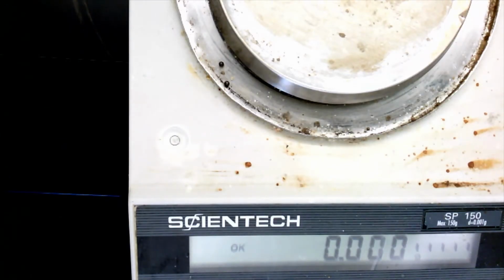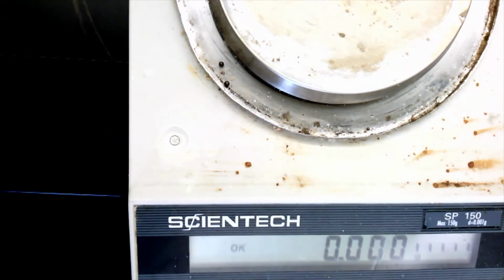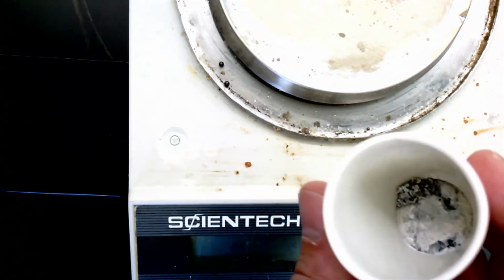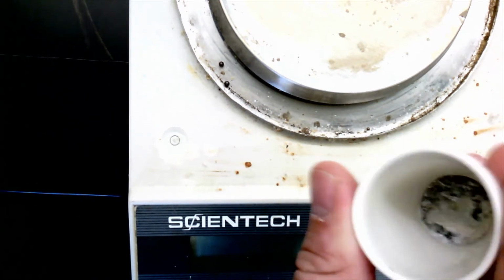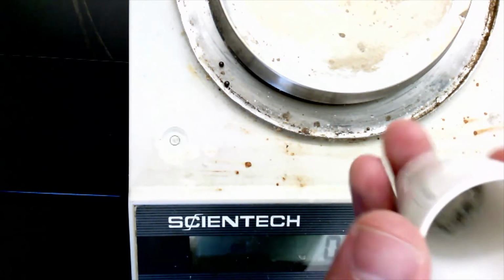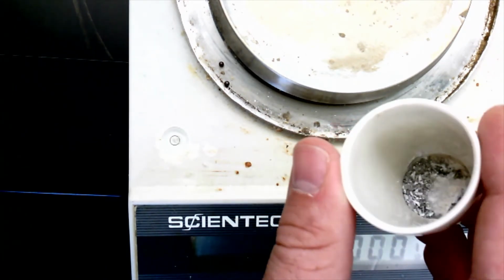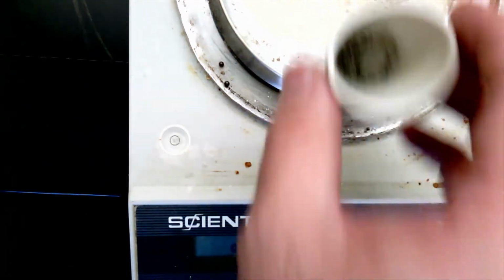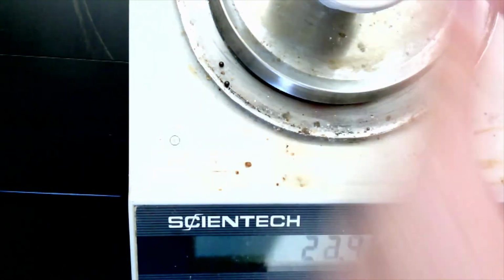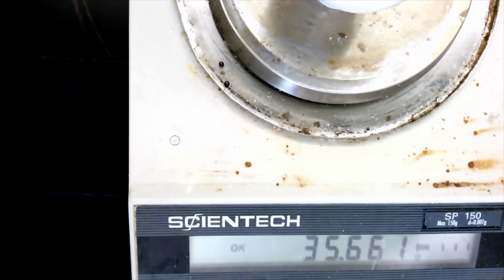Now that our product is nice and cool, let's take a look at it first of all. Okay, can we see in here? It's just sort of this dust at the bottom, this grayish, dark gray dust. That's what our magnesium oxide product looks like. And now let's go ahead and weigh this entire setup and see what we get.